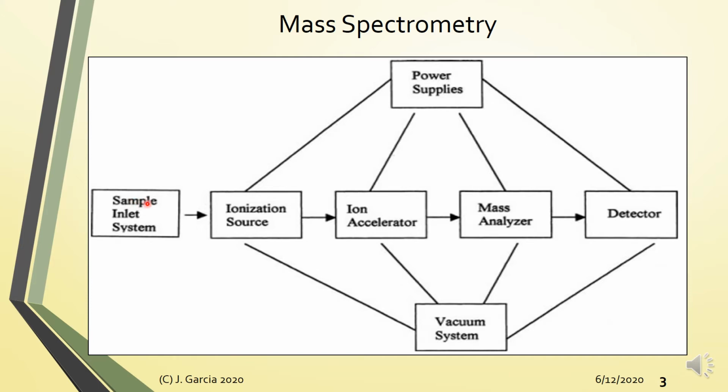the integration of the sample inlet system allows for the delivery of a minute portion of the sample coming from the plasma or coming from the LC or GC systems. Okay? For standalone mass spectrometers, there are also many kinds of sample inlet systems, but all are designed to allow a very, very small fraction of the sample to be introduced into the system.